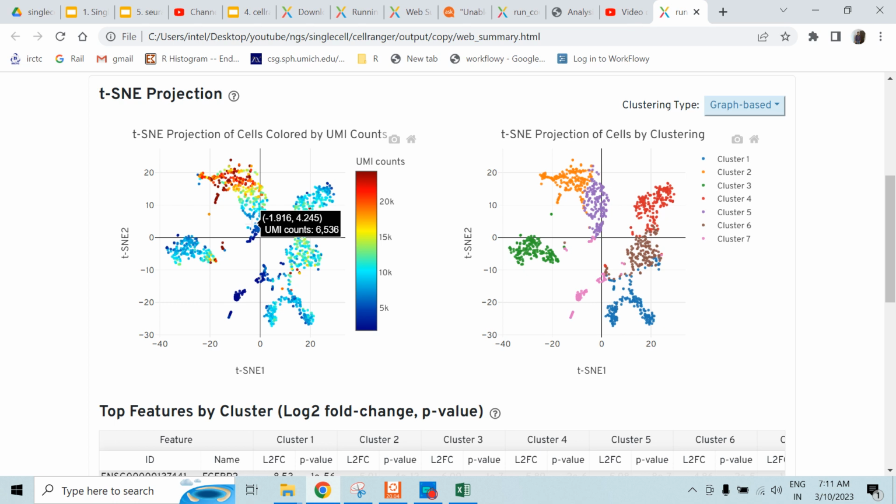That's where we have an alternate, better method, UMAP, which does the same thing but where the global information is retained, so both within and between distances on the UMAP plot are important. But just forget about that. In this example, it shows the TSNE cluster plot, and TSNE detected 7 clusters here. Here it's the same thing, but we are color coding with respect to how many UMIs are detected. The red dots have a higher number of UMIs, whereas the blue cells have very few UMIs present.